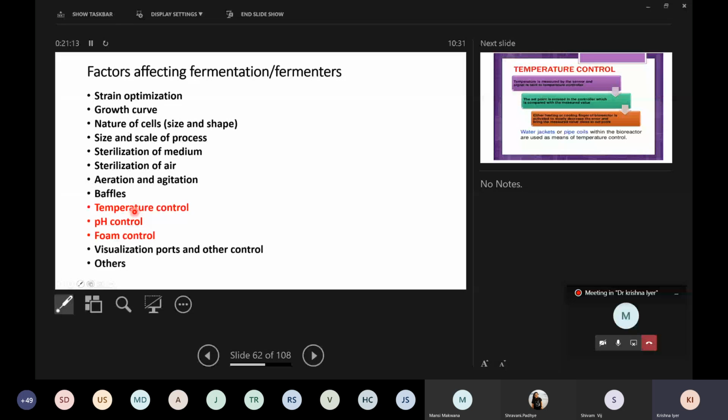Later on, after the fermentation is done, cleaning becomes a mess. If you don't clean correctly, these are pockets where organisms continue to grow, and it might be very difficult to then remove them or completely make a fermenter free of them. So controlling the foam is very important.